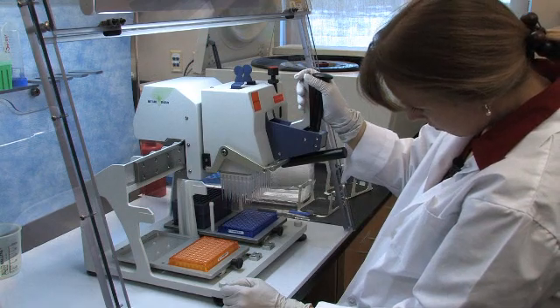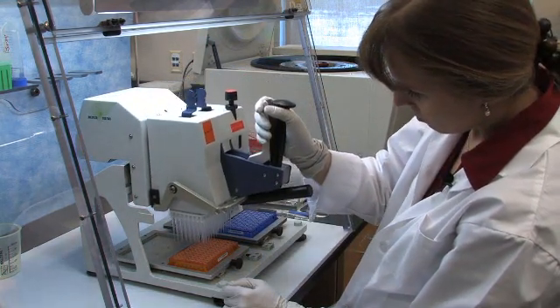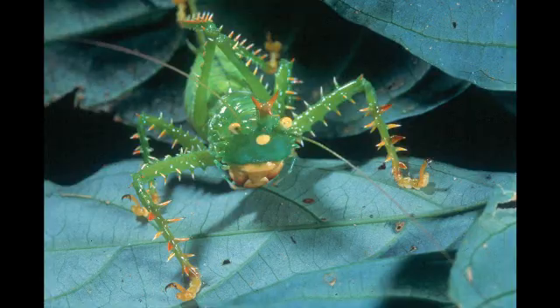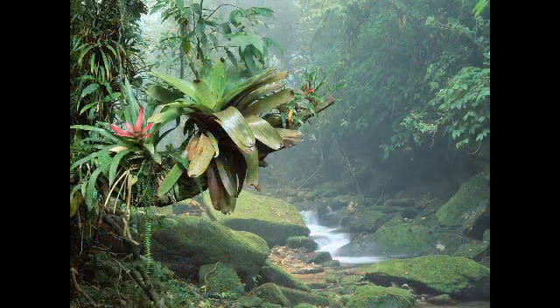On a typical day, the CCDB processes between 20 and 40 96-well sample plates. Starting samples for DNA extraction come from various sources, such as insect legs, ethanol-fixed tissue, dried plants, and fungal tissue.